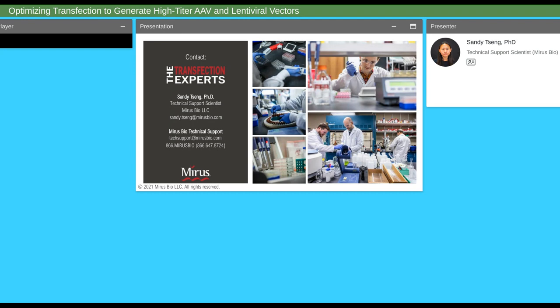Thank you so much, Sandy. Now, what is your complex formation volume relative to your total culture volume?